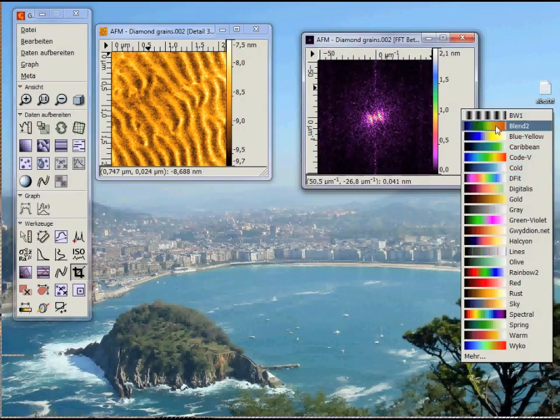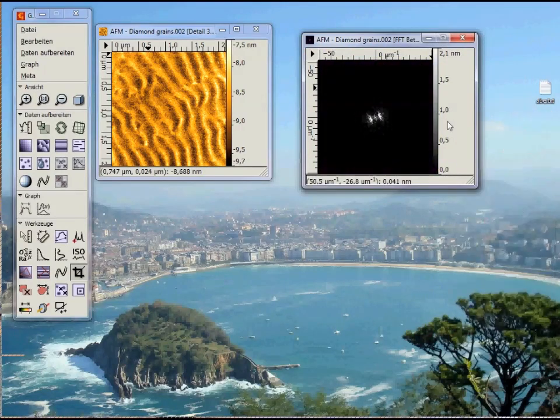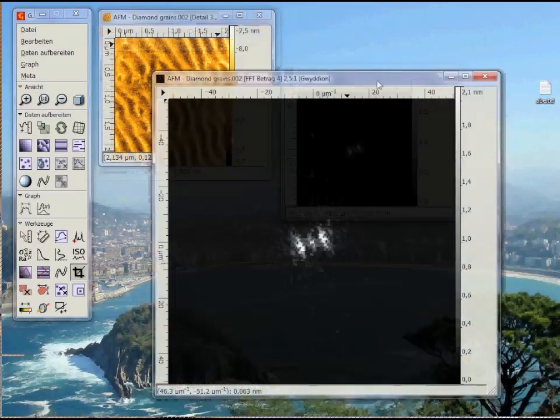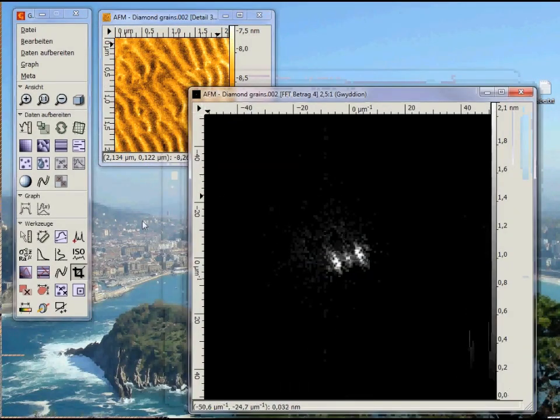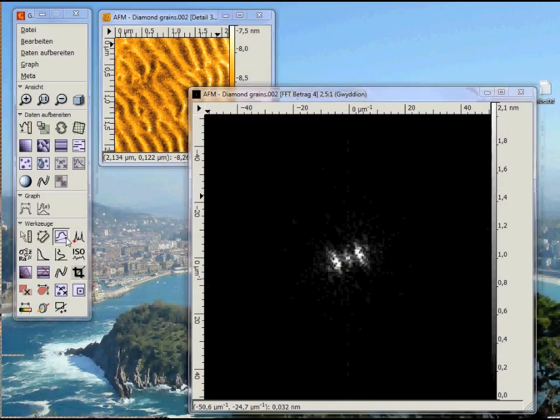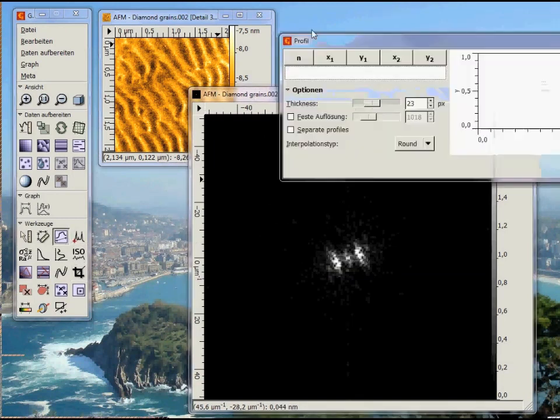I personally like to view it in grayscale. Now we can take a look at the line profile to gain information about our image.